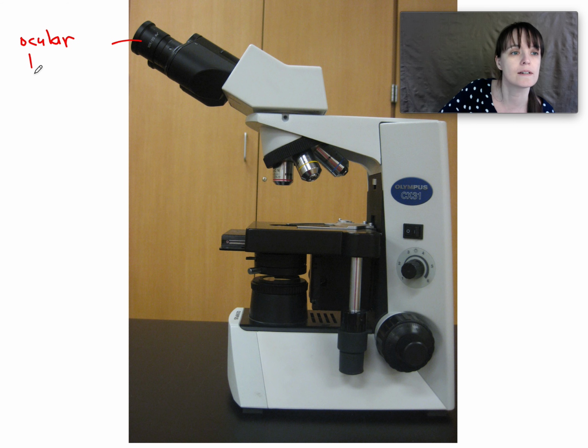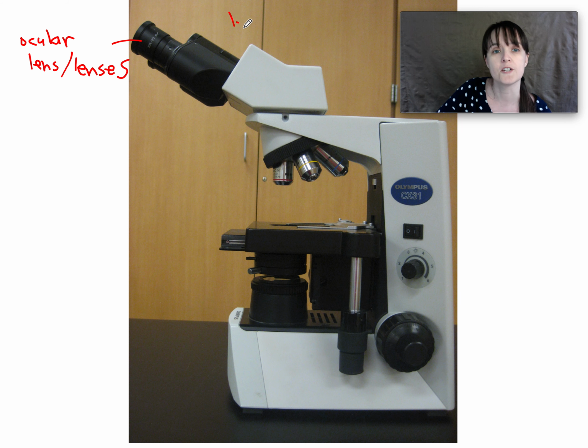O-C-U-L-A-R, ocular lens. And it's lens, or if you want to use the plural, lenses. In no way, shape, or form is this ever acceptable. Lens does not have an E on the end, and lenses has the E-S on the end.